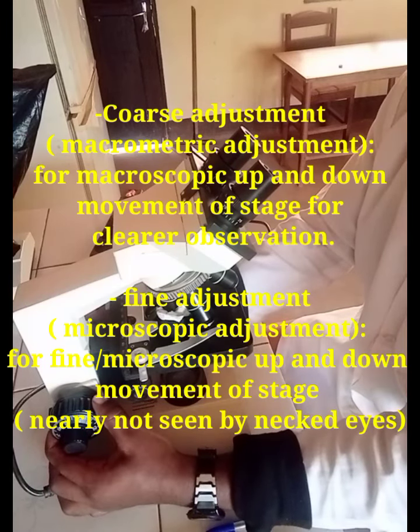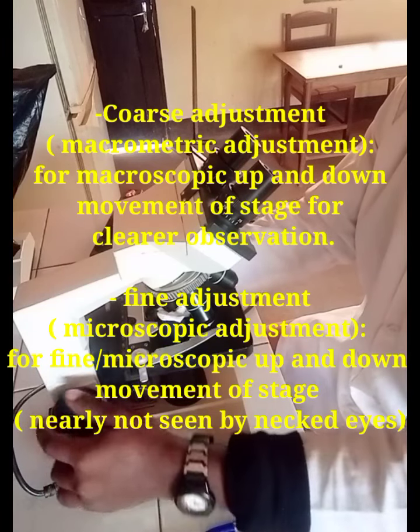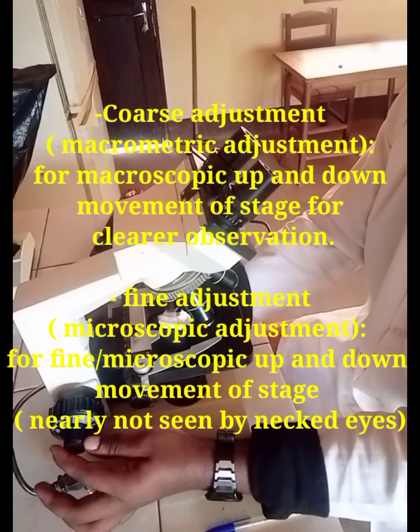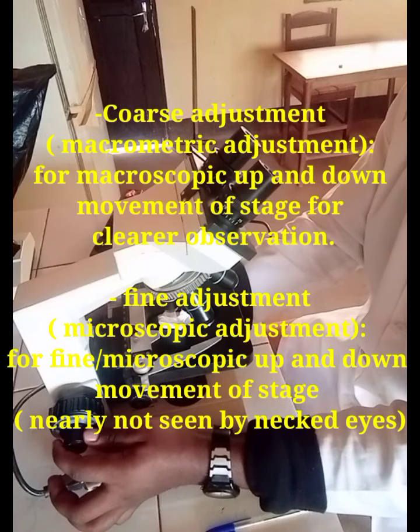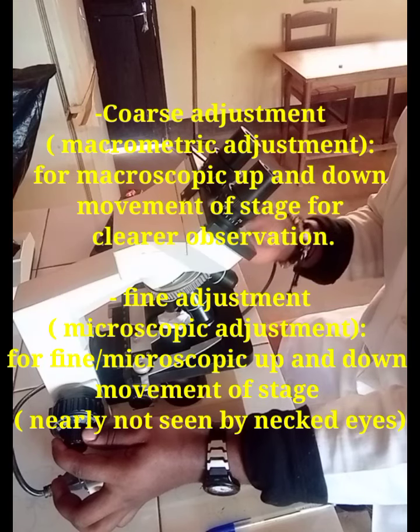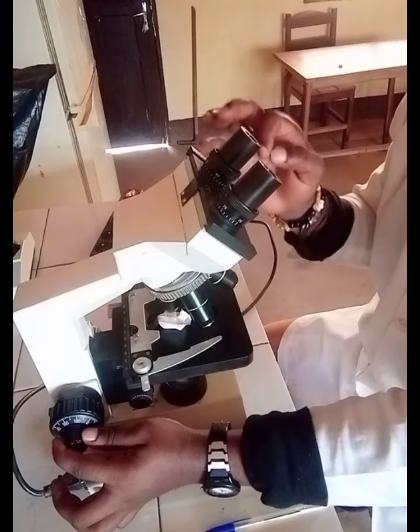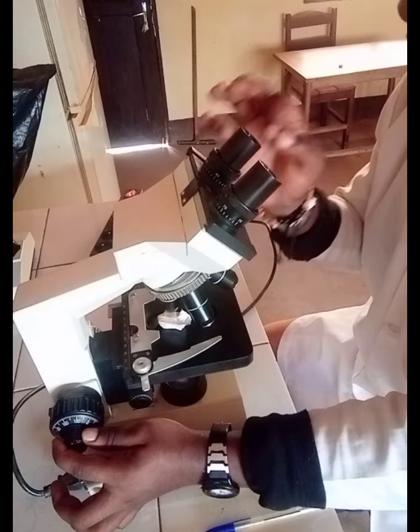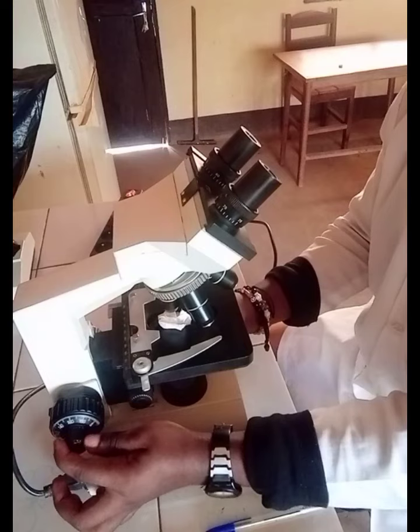Now, this macro adjustment helps us to move the stage upward and downward. As you can see, it helps us move the stage upward and downward, whereas the fine adjustment or the micrometric adjustment helps us also to move the stage upward and downward, but this movement is slightly not seen by the naked eyes. We can actually see the movement clearer when we look into the binocular lenses. That's where we see the movement of the stage by the fine adjustment.